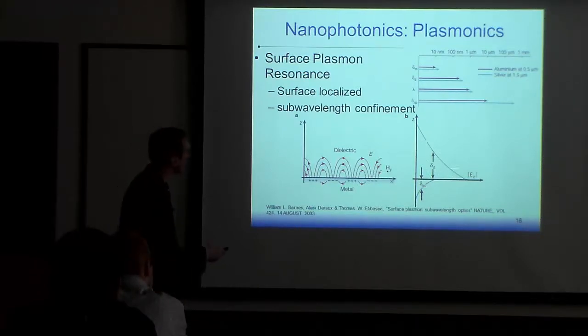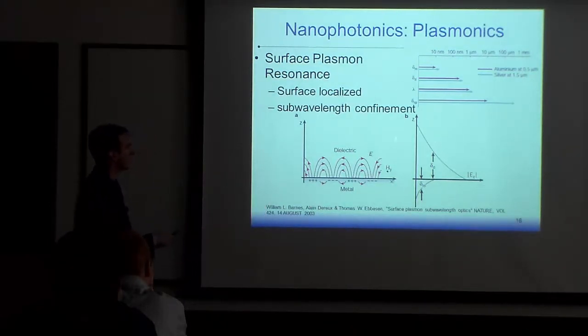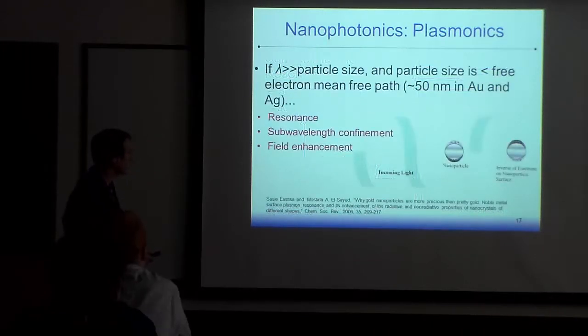And the interesting thing about this is that this localized field, this delta D here, is on the order of hundreds of nanometers. This is very nice. So if you put in light at 1.5 micron, or put in light at 500 nanometer, you end up with a localized field on the order of hundreds of nanometers. So you can really have an intense localized field right there, and you can do sensing of proteins binding on cell membranes or something on the order of hundreds of nanometers. It gives you this enhanced resolution.